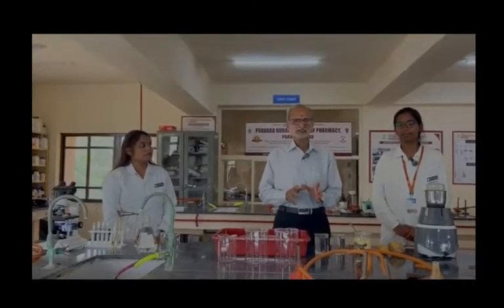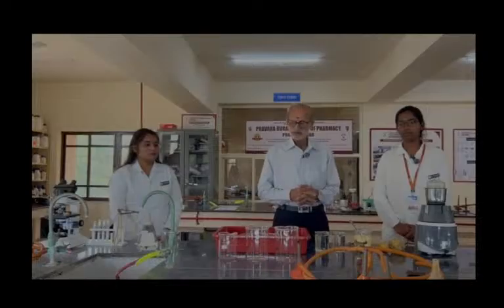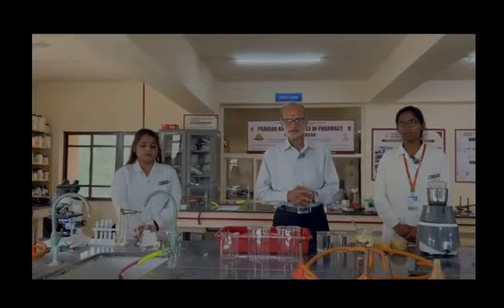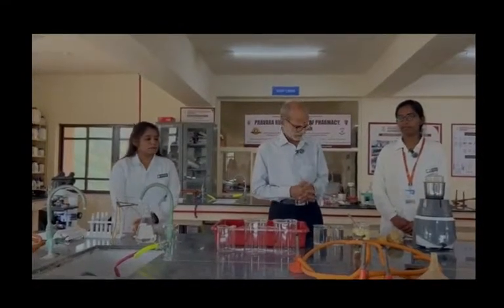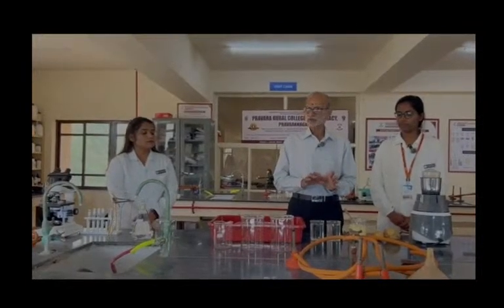There are three important starches. Number one, and most widely used, is cornstarch. Number two is potato starch, and the third one is tapioca starch. So these are the important starches, and starches are present in many other plants, but these three are commercially important starches. We are going to demonstrate the starch separation from potato.